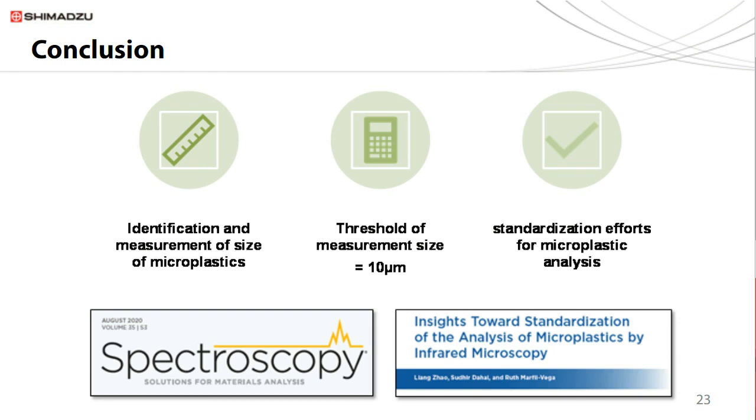When the sample size was changed to 10 by 10 microns, signal-to-noise ratio showed a noticeable increase with the increase in number of scans. Theoretically, as mentioned earlier, signal-to-noise ratio should increase as more scans are averaged when the signal is detected. Therefore, this result further verifies that the signal from the 10 by 10 microns was real and that from 5 by 5 microns was primarily noise. This confirms the threshold of 10 by 10 microns.